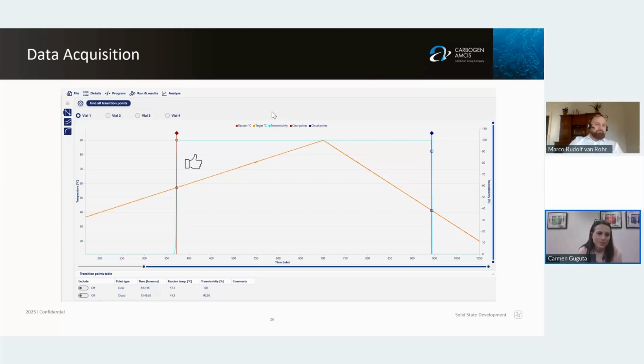One last one. I said already the last one, but I see one more. From Pedro: can you reuse this data to create population balance models for crystallization modeling development? I wouldn't recommend that, because for PBM work, the quality of your data has to be really good.